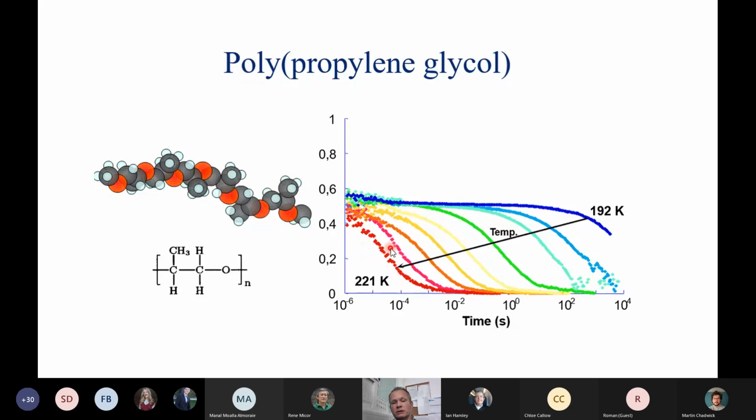And this correlation will be dependent on temperature. In this case, you have not a solution, you have just a bulk material. And inside of this bulk material, you have some kind of thermal motion. So dynamic light scattering will show you correlation, right? It will show you some non-zero correlation function.